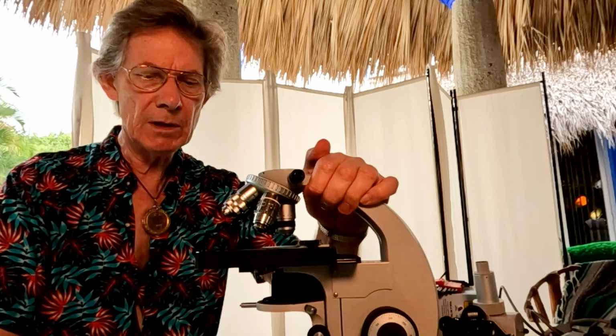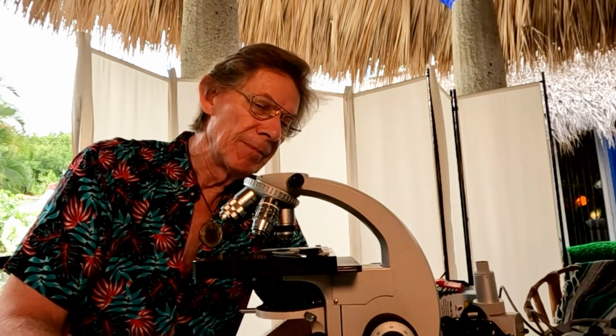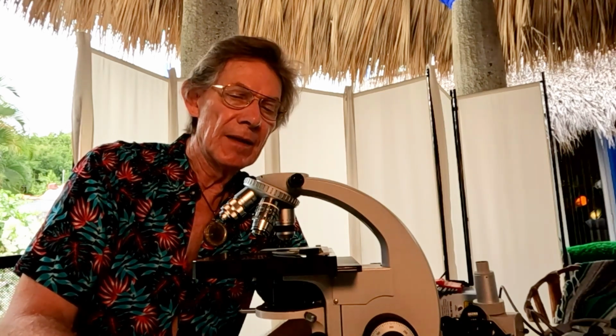If we look at the microscope, we see it has many different components. It's a very complicated and sophisticated technology that has evolved over the last couple of hundred years. The best microscopes are produced in 3 countries. I personally use German microscopes.